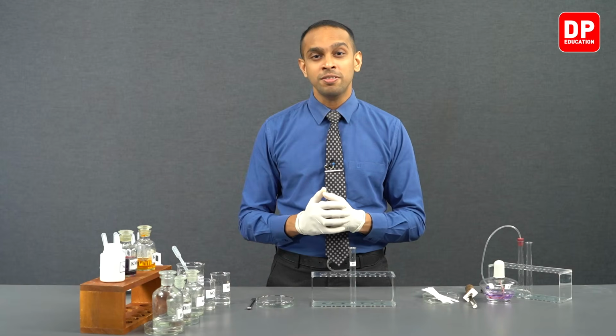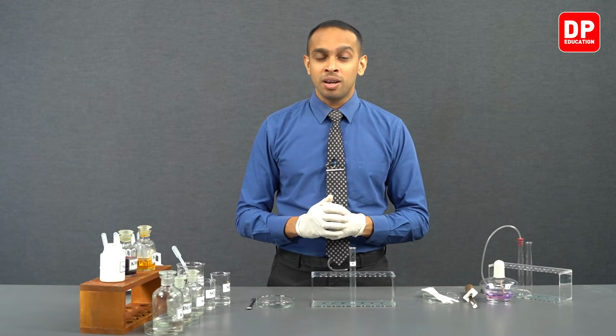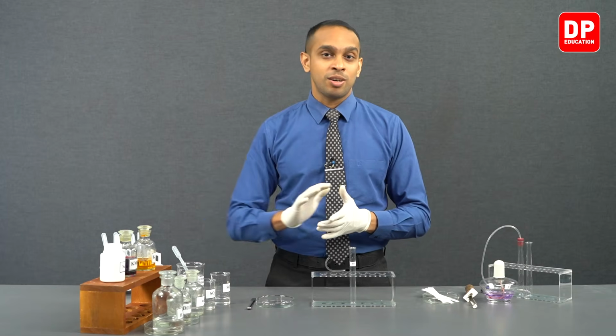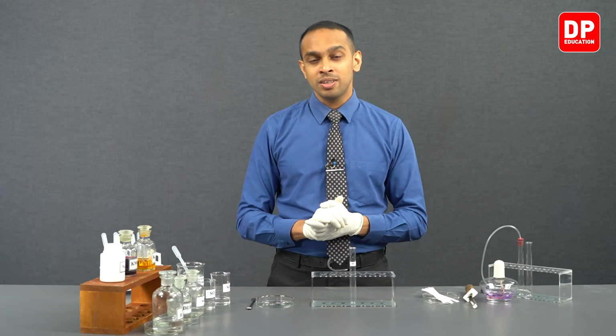So we are going to observe the color changes that are given when we use acidified potassium permanganate as the oxidizing agent, and when we use potassium dichromate as the oxidizing agent as well. So let's first get our oxidizing agents prepared.